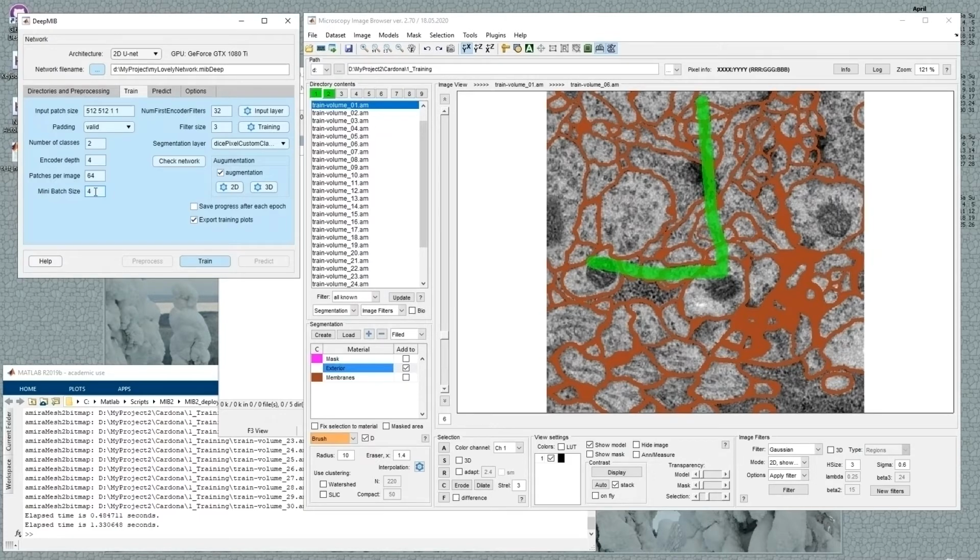The higher the number here, the quicker the process will go. But we should understand that during the evaluation, the score that gets minimized during training is actually an average, which is calculated from these 4 images that go to the network. So if you have some unbalanced classes, there could be some kind of limitations due to that.